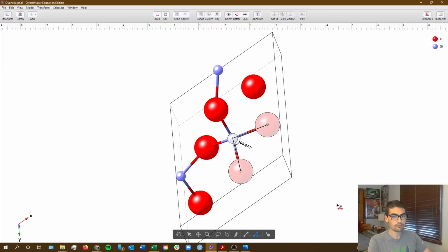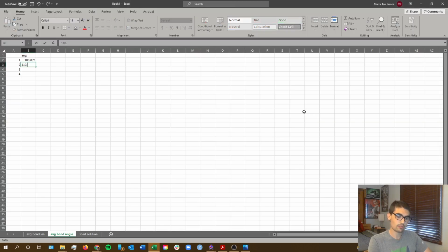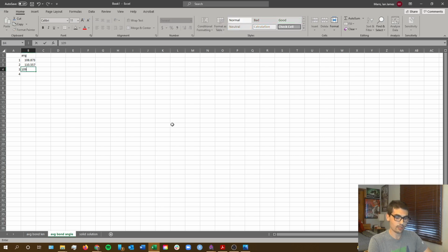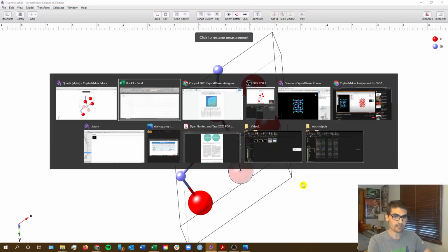Okay. Next angle. Click on an oxygen, silicon, oxygen. 110.557. Okay. Next one. Oxygen to silicon to oxygen. 109.266. Finally, oxygen, silicon, oxygen, 110.557.